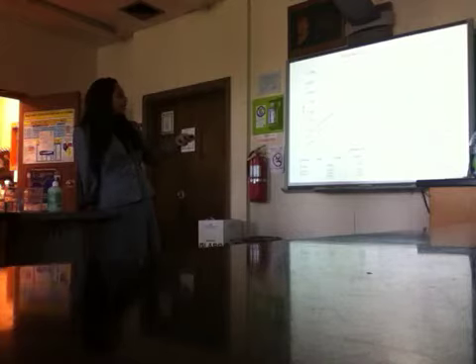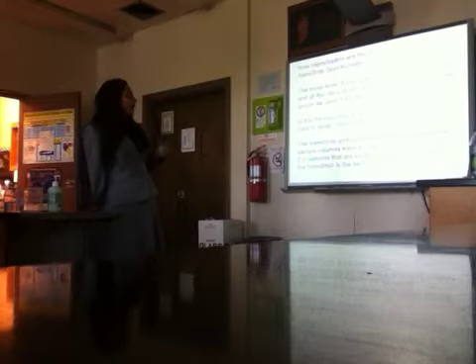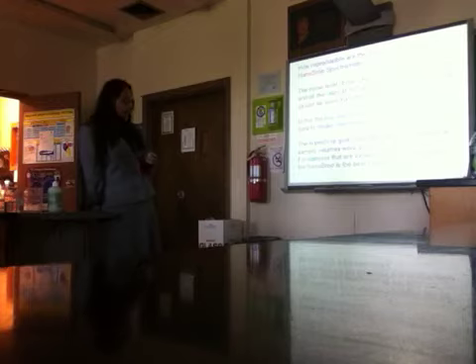So we can say that the result obtained from the nanodrop is reproducible, and it has an error, but it's not larger than 5%. We can say that. Okay.